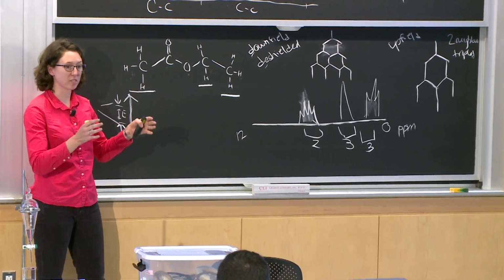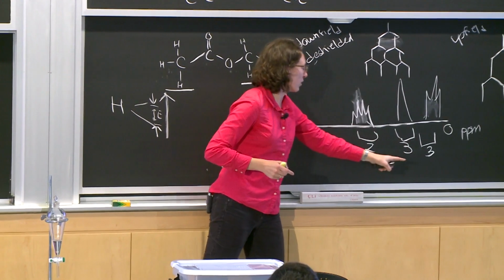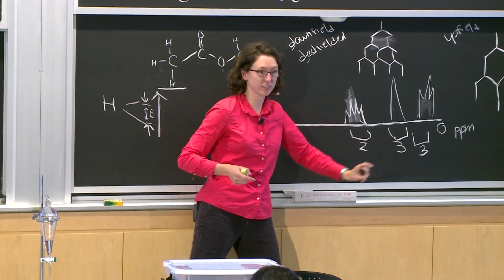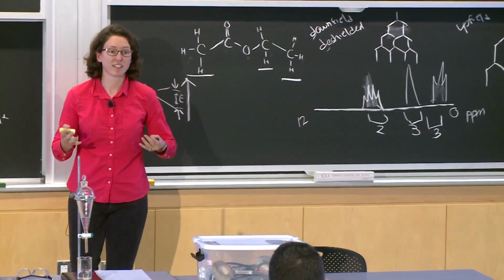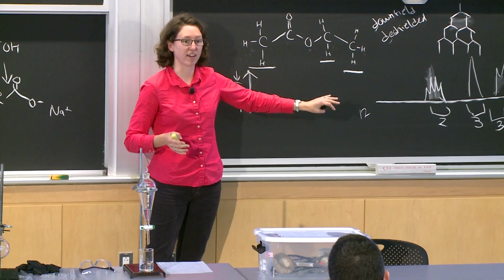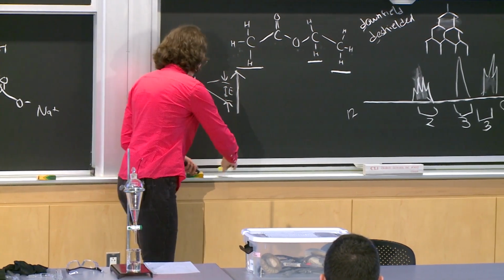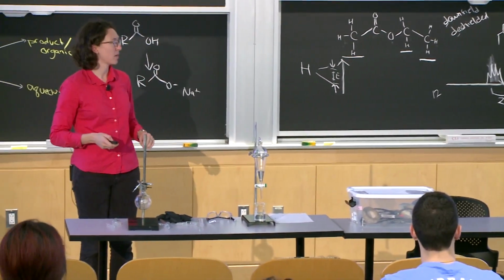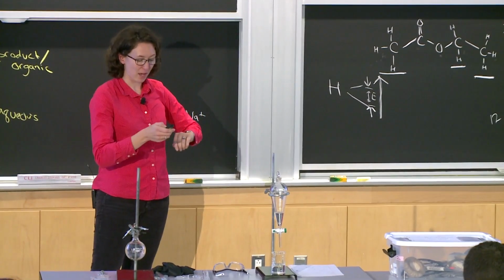And then when you get your NMR spectrum, you can compare the number of peaks and the integration of the peaks. So if you know that you have a methyl group, you should be looking for some signals that integrate to 3. And that is how you can use this as a technique to identify the structure of your unknown. Walt will do a much better job explaining all of this in a bit, but just so you've seen it before you get a chance to take your spectrum in lab, that is a quick introduction.